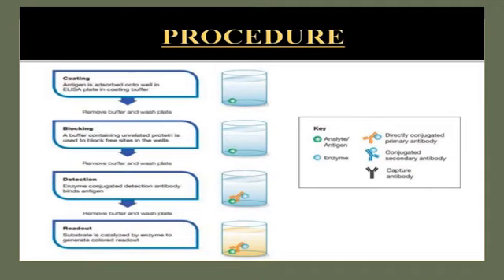So this is the reason why we add a blocking buffer. And then we will remove the buffer after a certain time of incubation and wash the plate.